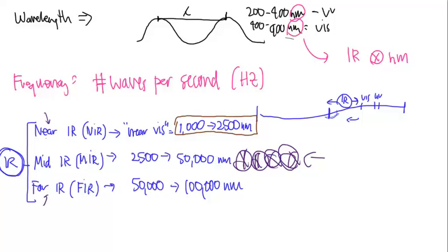The far infrared is a little too far away. So Goldilocks likes it right in the middle, and that's the mid-infrared region for us. This is the region that we talk about in infrared spectroscopy, and this is how we will begin to discuss how the infrared will do the job that we use it for in the laboratory environment.